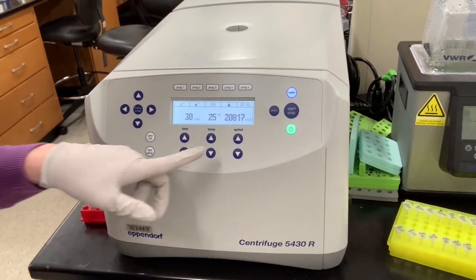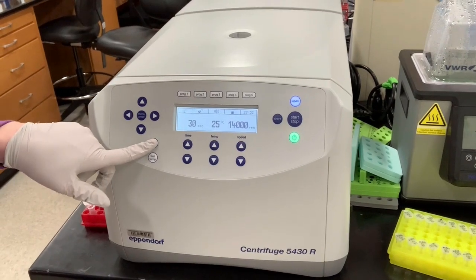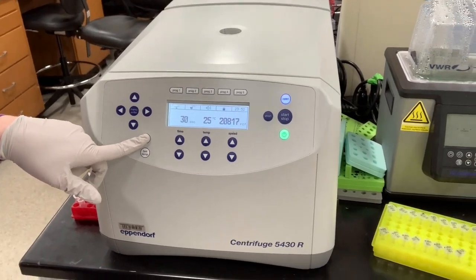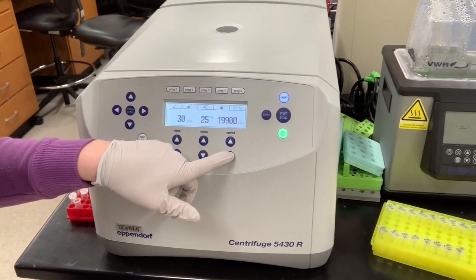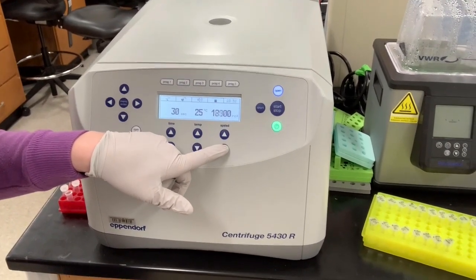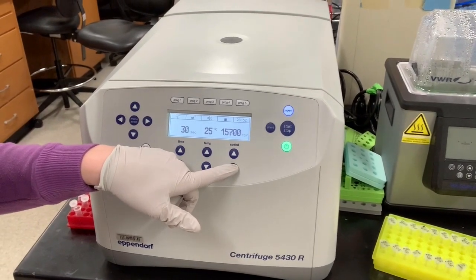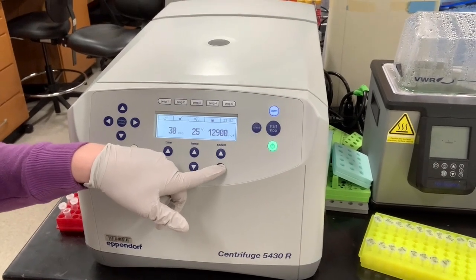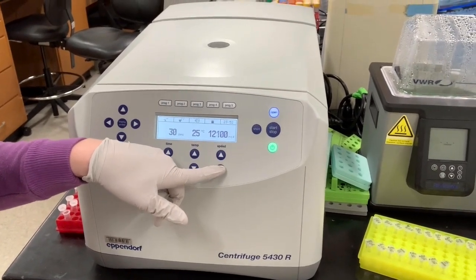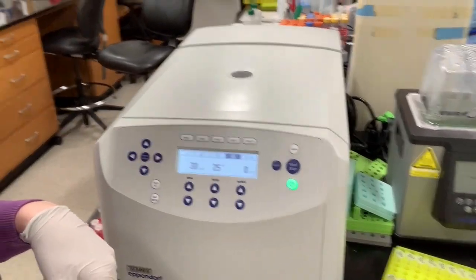And as it said, it needed to be 10,000 Gs or more. You can go back and forth between RPMs and RCF, which is Gs. We only need to be at 10,000 or more, so I'm going to go down to 12,000 RCF, which is the same thing as 12,000 Gs. Okay, I'm going to hit start, and this is going to centrifuge my samples.